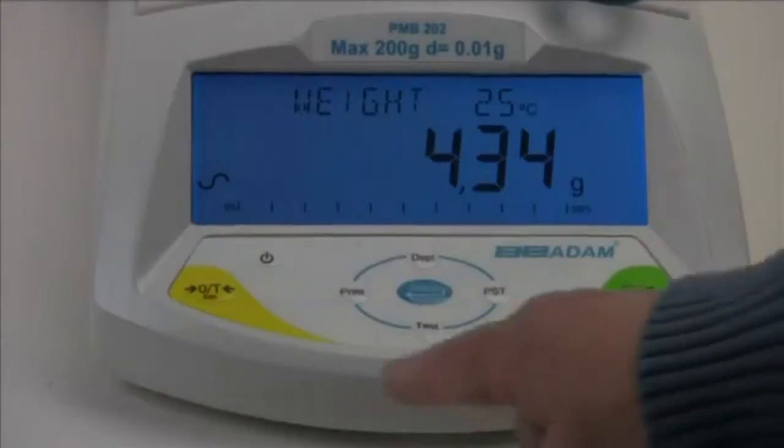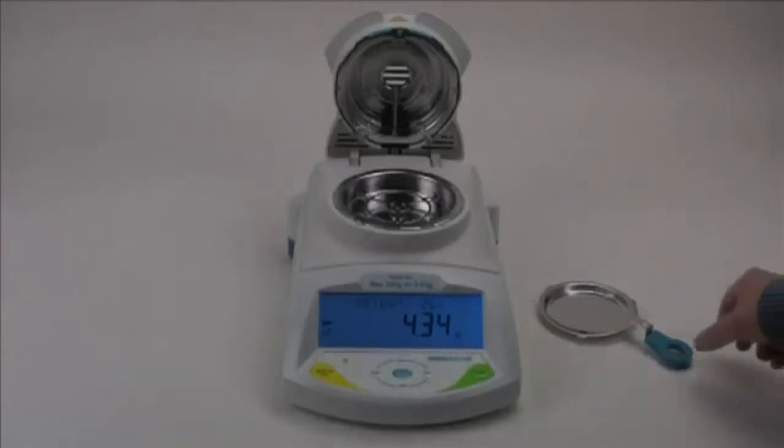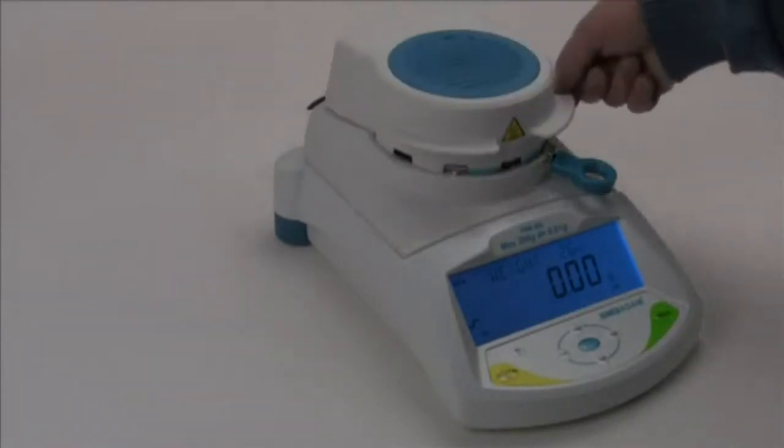Now let's go through a simple moisture test to demonstrate how easy it can be to get results with the PMB. The settings we are about to show you are not ideal for all products. You may have to adjust the actual settings for the type of moisture determination that you are attempting to do.